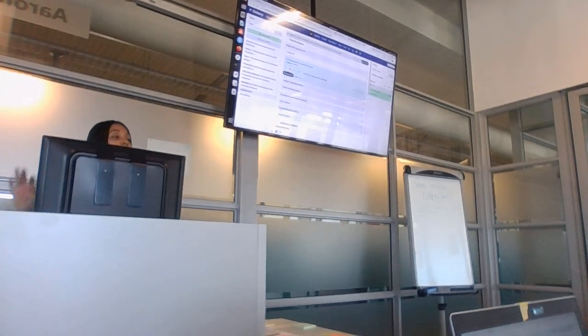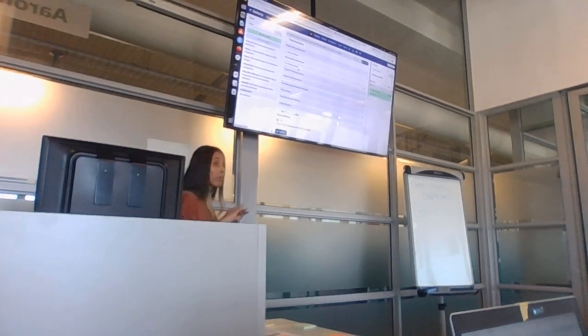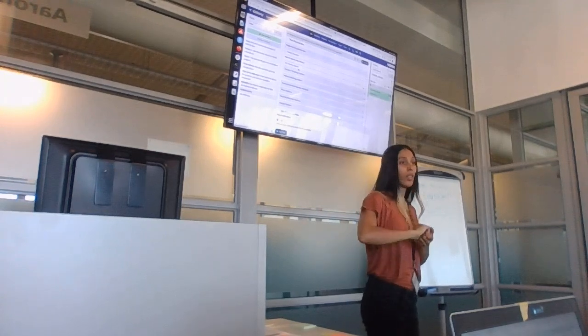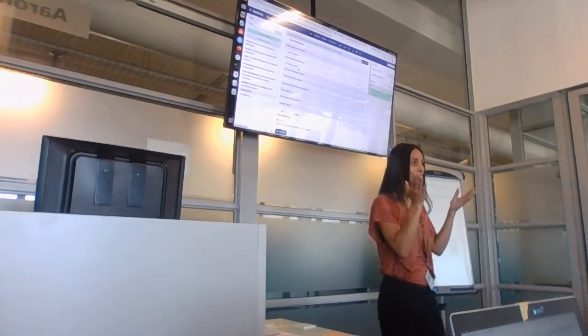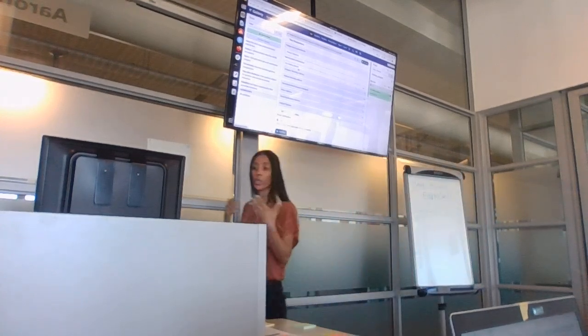The names are still the same, but if you hover over it, this says single dataset, multiple datasets, and dataset collection. You made a collection, so you will have to change this on top to paired collection, right? Now you see it's automatically selected for you. However, if you had multiple collections in there, like let's say cholera Kenya and cholera Namibia, you would have to choose which collection you want to run it on.